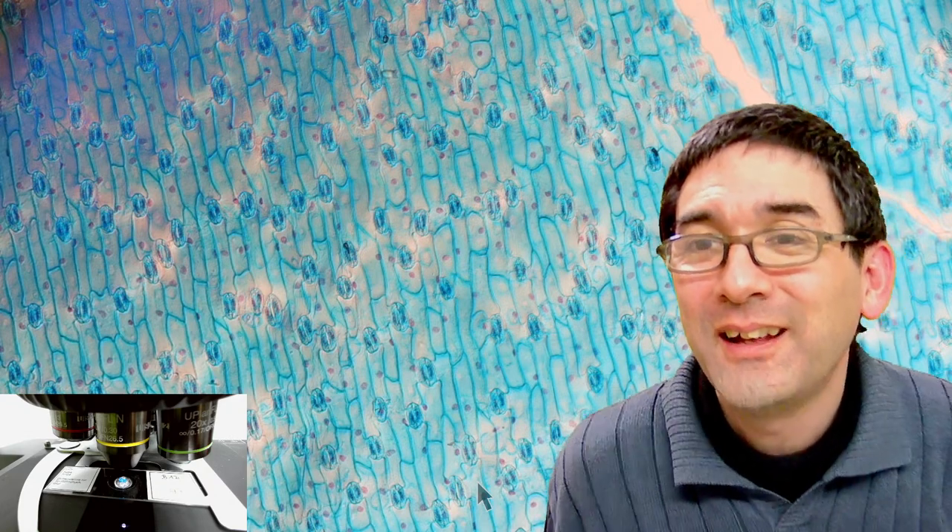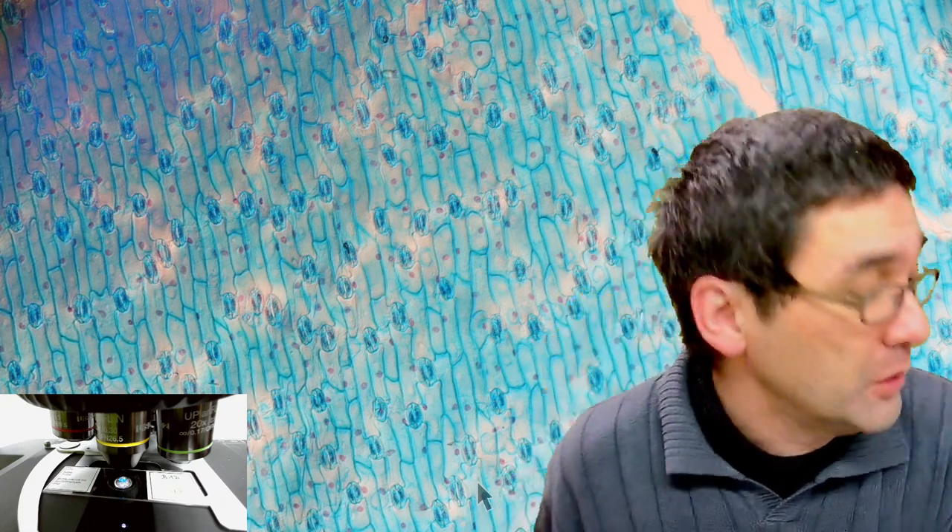Plants have no muscles, so how do the guard cells open up and close? Due to differences in osmotic pressure — that's a really interesting question. Plants have no muscles, but plants are still able to move. For example, carnivorous plants like the Venus fly trap. The movement in this case is because of water pressure inside of the cells. The cells of the guard cells have an apparently asymmetrically thick cell wall. If water goes into the cells, it's going to swell in an asymmetric way, and this opens and closes the central hole.